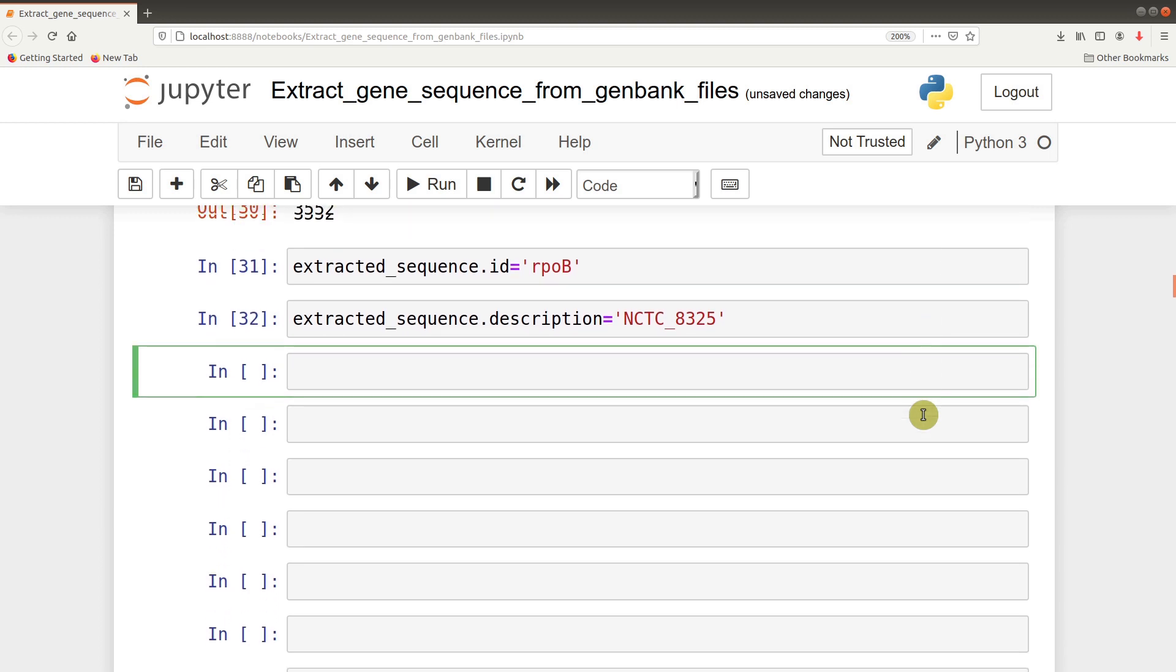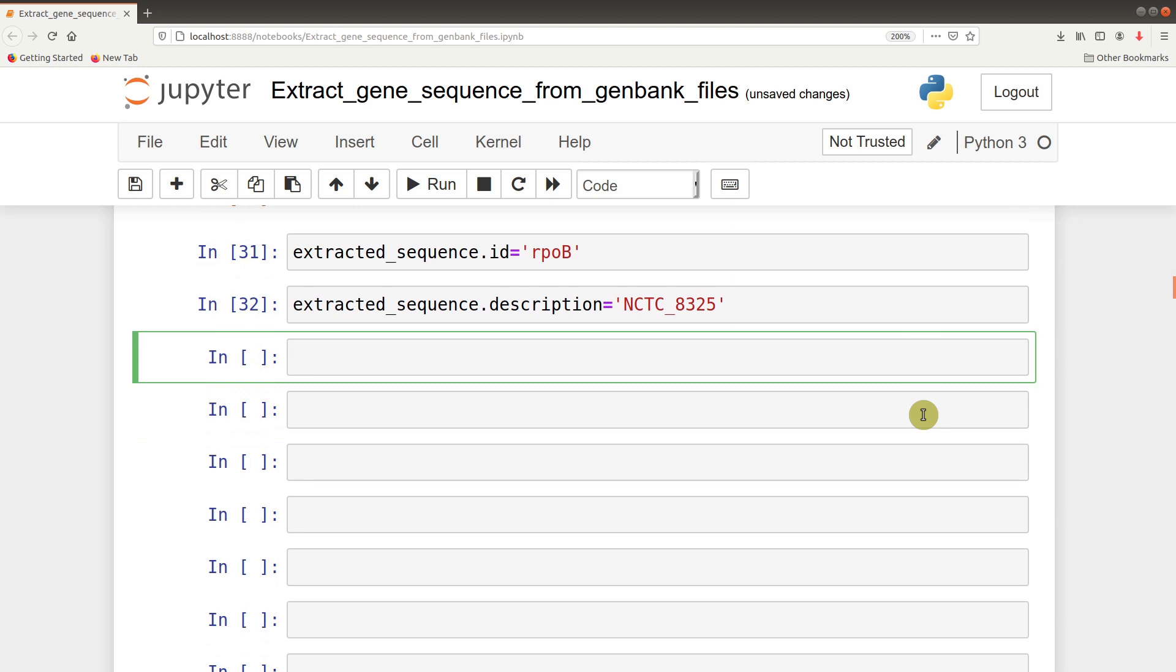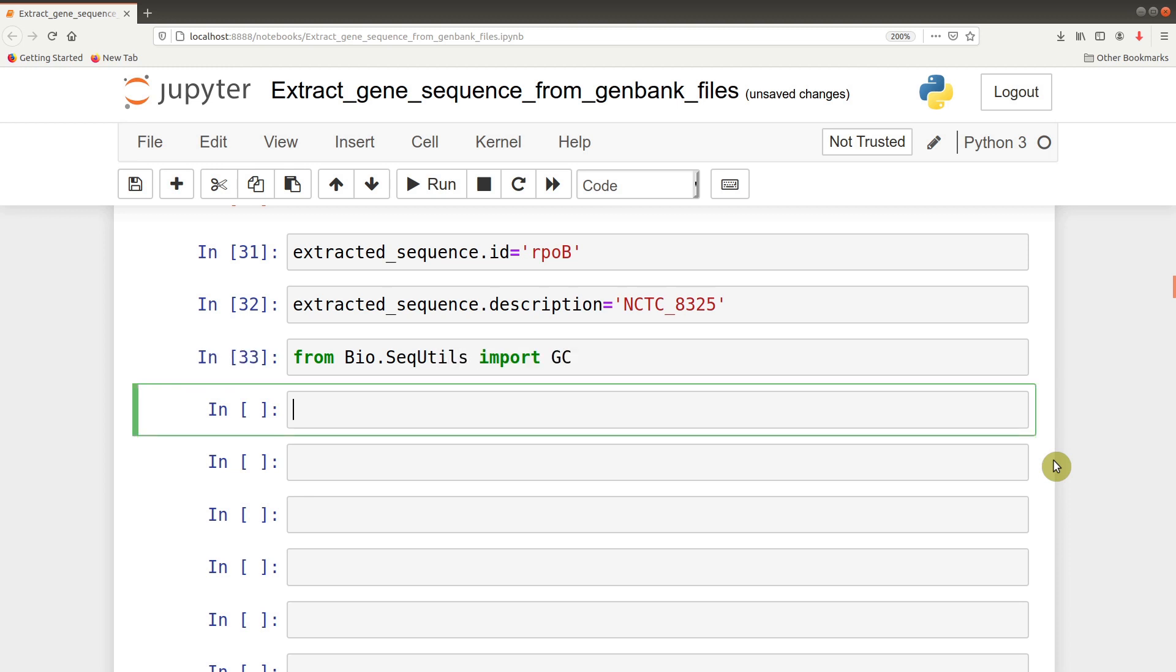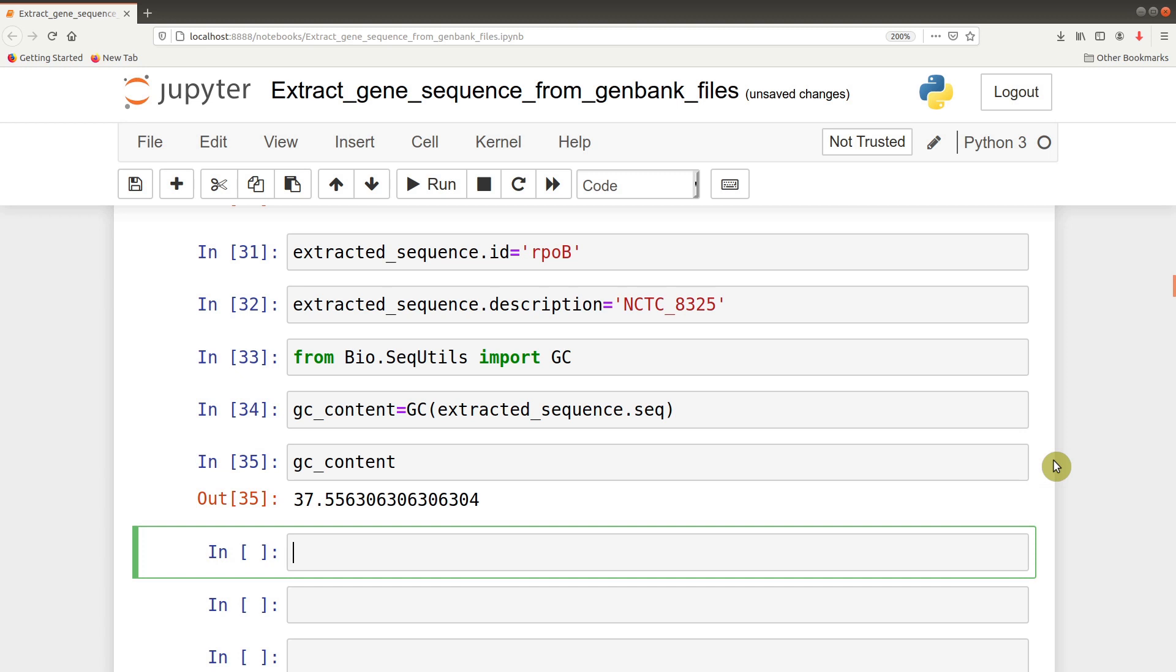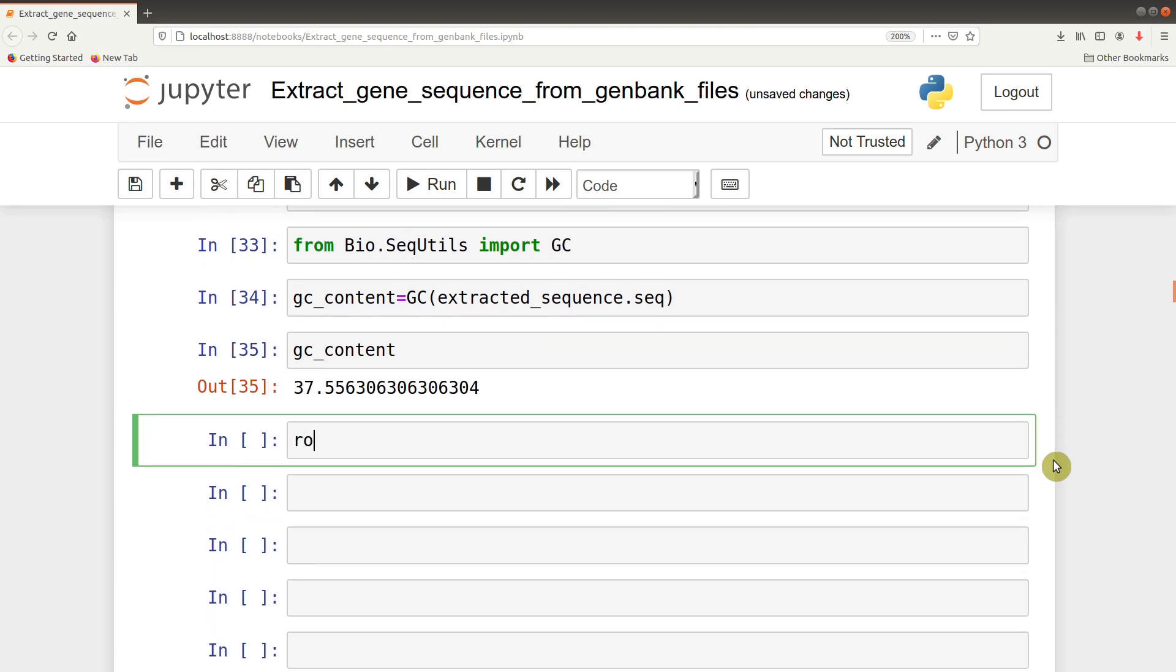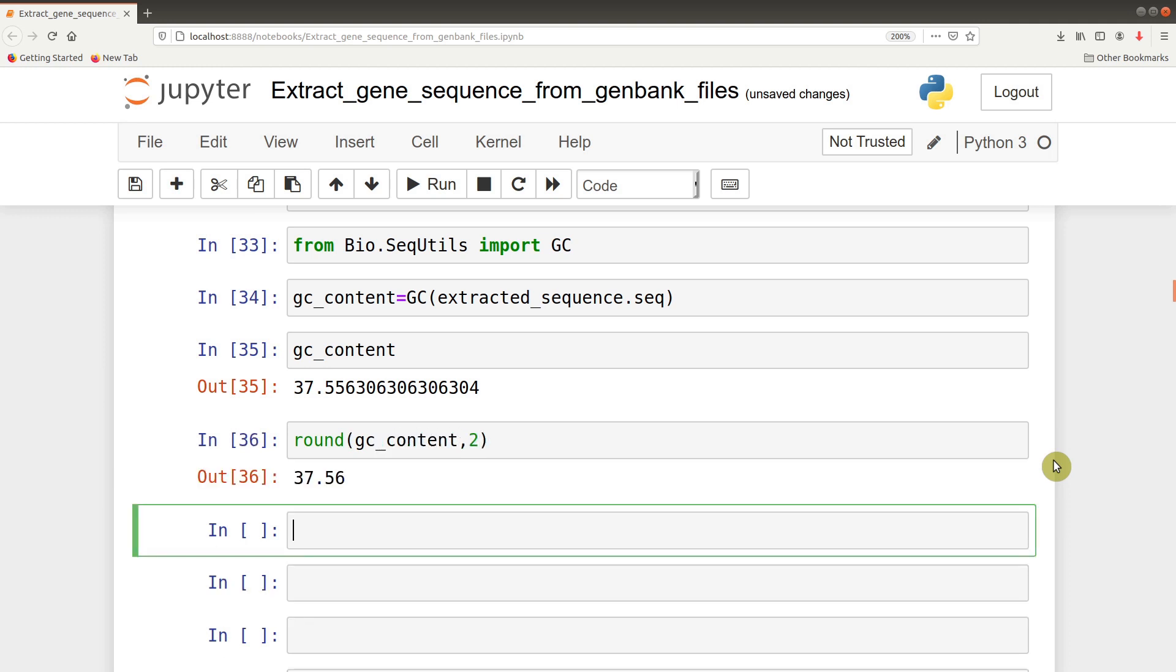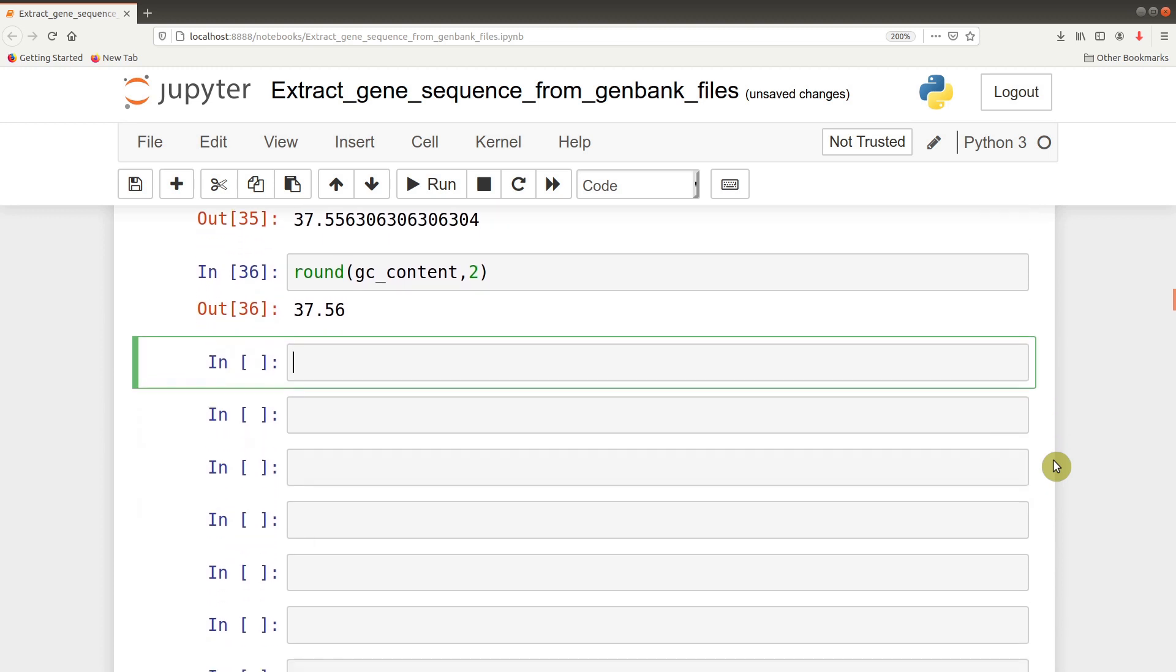After we have all this information, there are a number of things we can do. One is to check the GC content. To do that we have another library we'll call: from Bio.SeqUtils import GC. We can say gc_content equals GC extracted_sequence.seq. That gives us the GC content. We can even round this to two decimal places by saying round gc_content and giving the number of decimal places. Even from this stage, there are a lot of things we can do depending on your research questions.